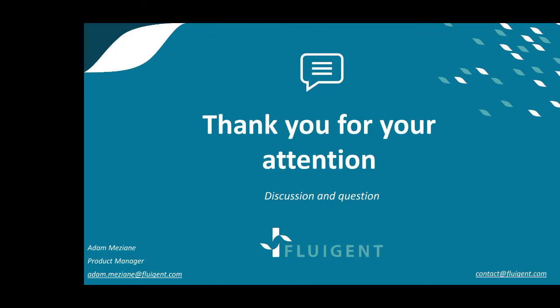Can I speak? Yes. In the case of the test with the lysozyme, we found a very small amount of lysozyme in the continuous phase, meaning that the encapsulation efficiency is very high. So the efficiency is higher than 95%. A very low quantity of API is lost in the continuous phase because the process is very fast.